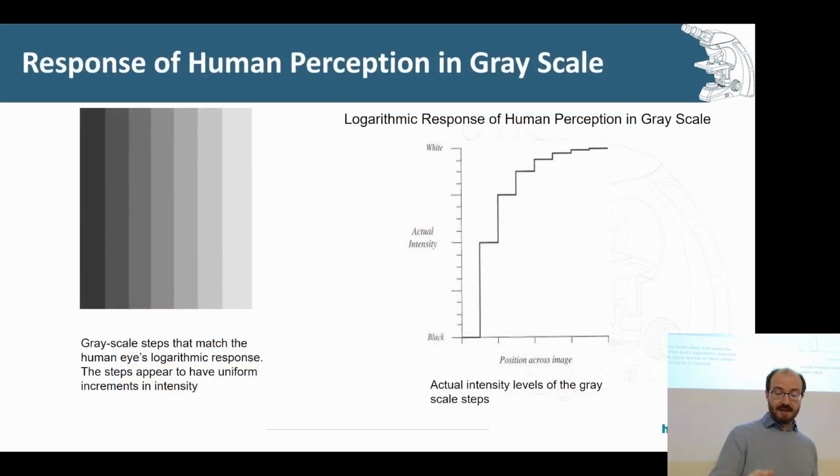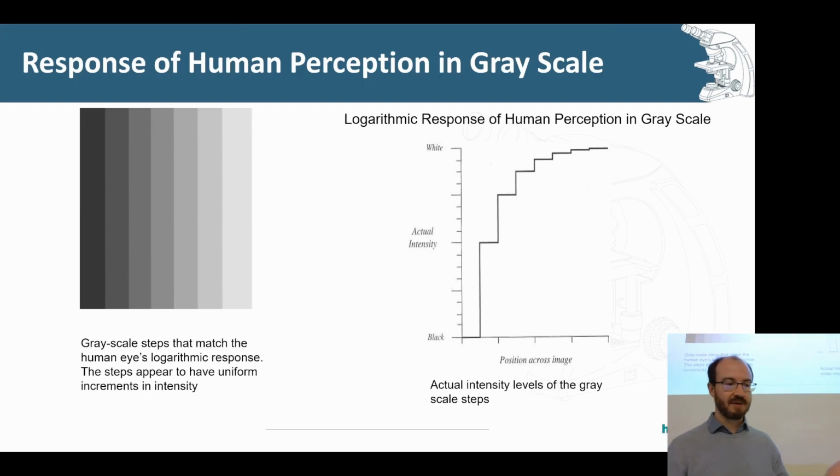There's also an important thing to mention here, which is that the visual perception of light intensity is not uniform. So if I was to count the number of photons, and I'm not going to overly simplify this, but if I have 1 photon coming in, and then 2, and then 4, if I double the number of photons, the intensity in our perception doesn't double. It's not linear. So at, let me just make sure I got this right.